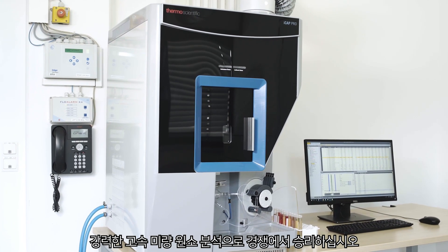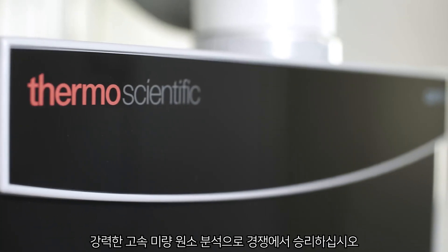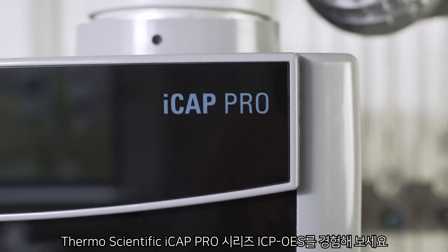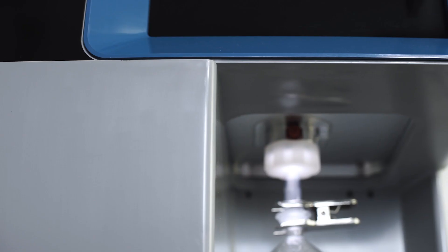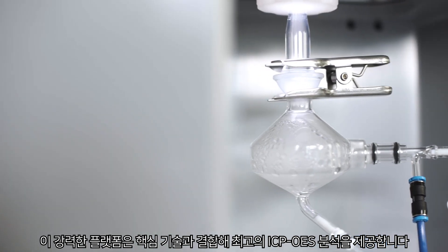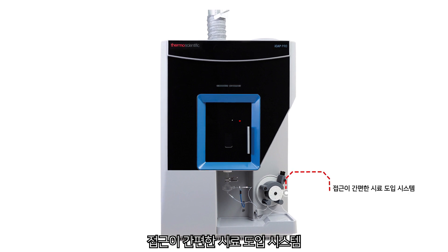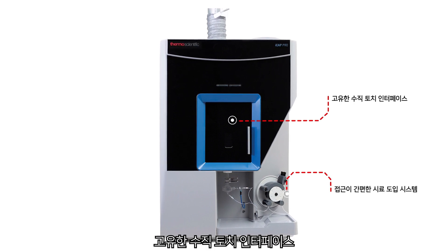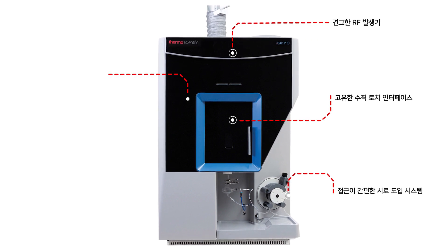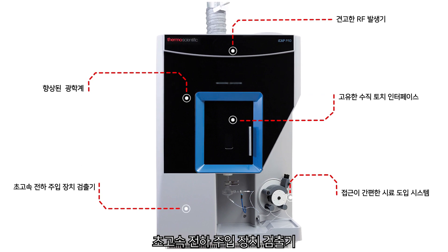Perform like a pro and win the race with robust high-speed trace elemental analysis. Discover the Thermo Scientific iCAP Pro Series ICP-OES. This powerful platform combines core technologies to deliver the ultimate ICP-OES analysis: easy-access sample introduction system, unique vertical torch interface, robust RF generator, advanced low-purge optics, and ultra high-speed charge injection device detector.